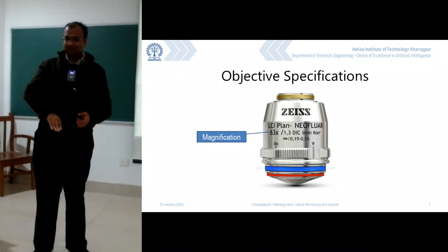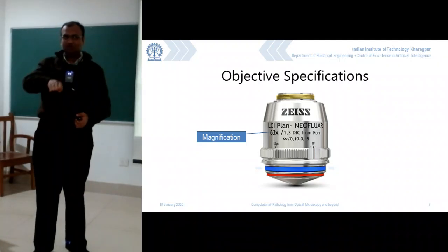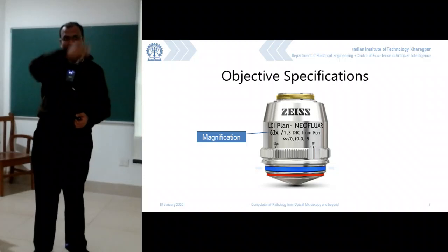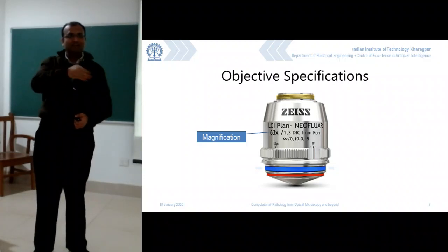Now whenever light is coming from one refractive index to another refractive index, it's going to propagate, plus it's also going to reflect following the critical angle principle. Because you have a higher curvature, you have a higher chance that it will obey critical angles and get reflected for a higher magnification lens.